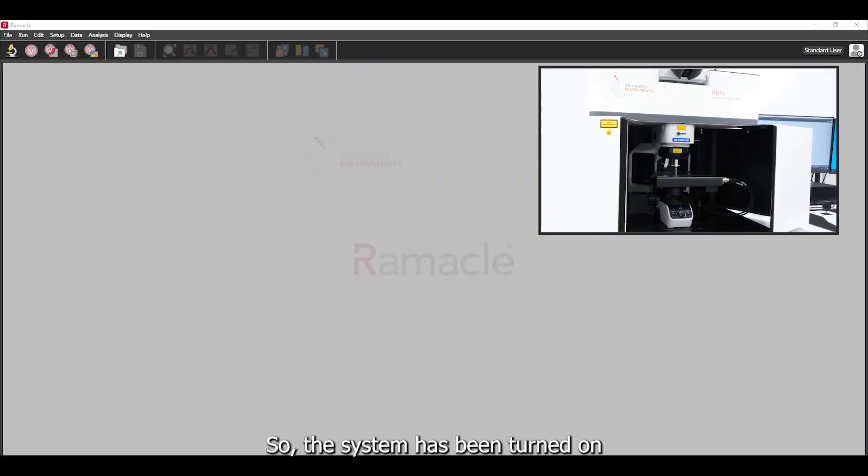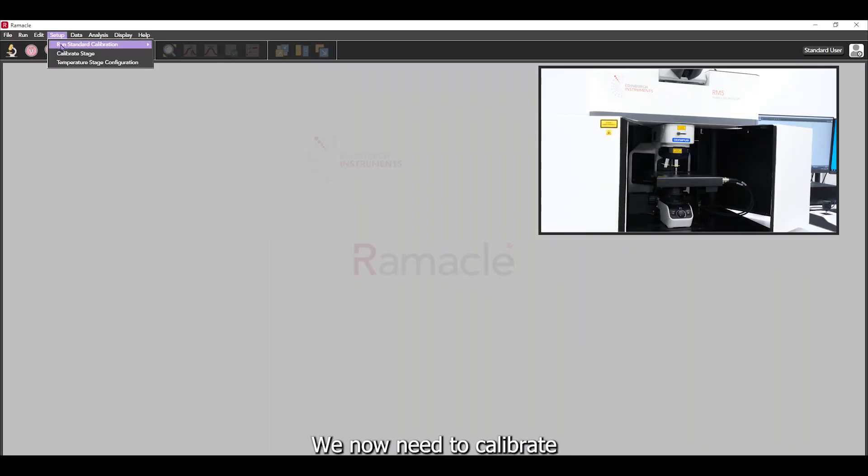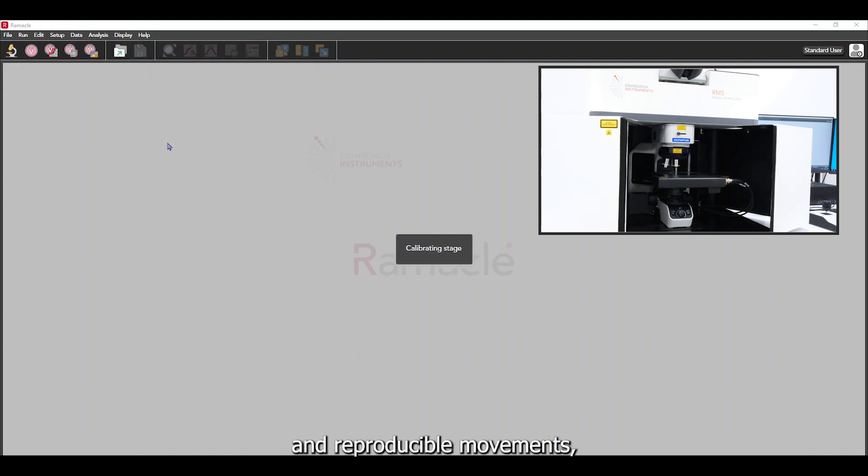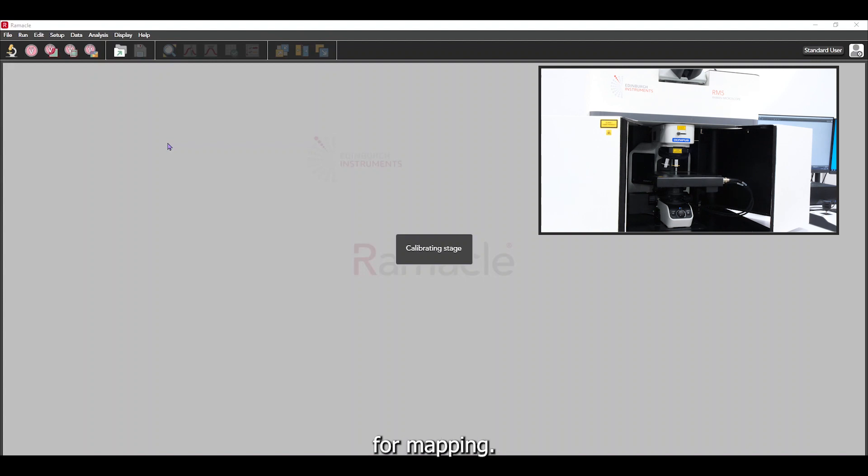The system has been turned on and Ramacle has been opened. We now need to calibrate the microscope stage. This process ensures that the stage will produce accurate and reproducible movements which is absolutely critical for mapping.